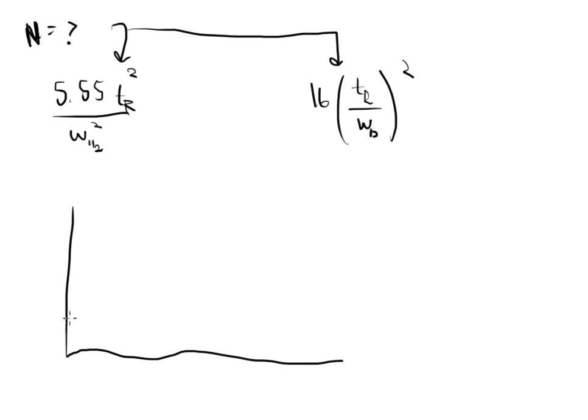All right, so let's say that we get a chromatogram, and here's my baseline. And let's say that a component comes off and it comes back down and it goes back to baseline, and this is what I see. Well, the reason that I have two versions here is because it depends on what the problem gives me. What kind of information do I have at my disposal? One of these equations uses W sub b. The W basically means width, and I'm looking at b, which is the base. So this is W sub b, the width at the base of the peak.